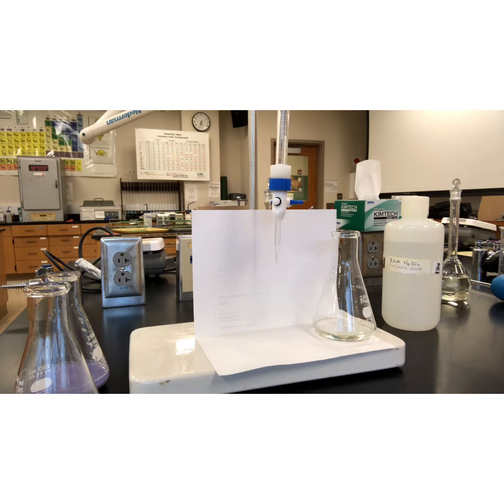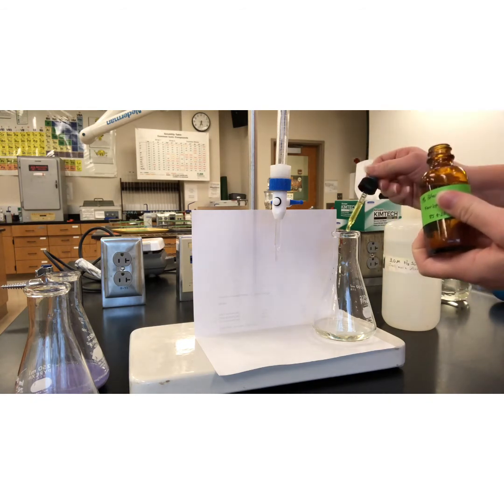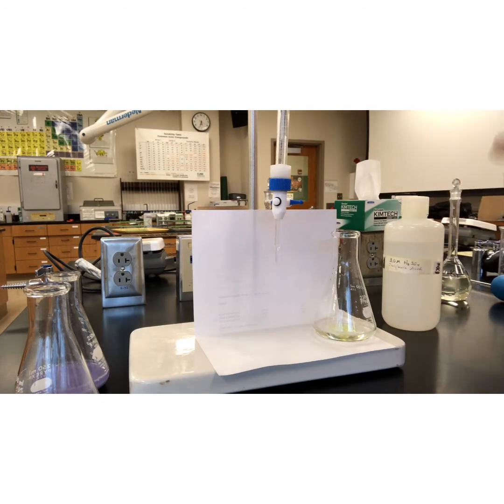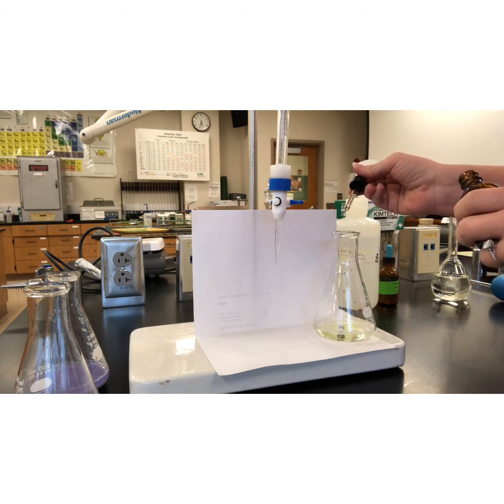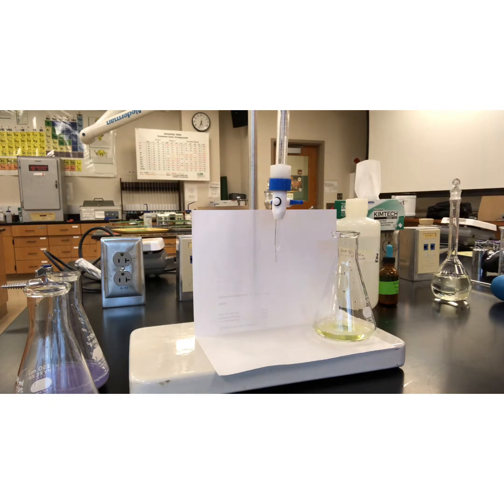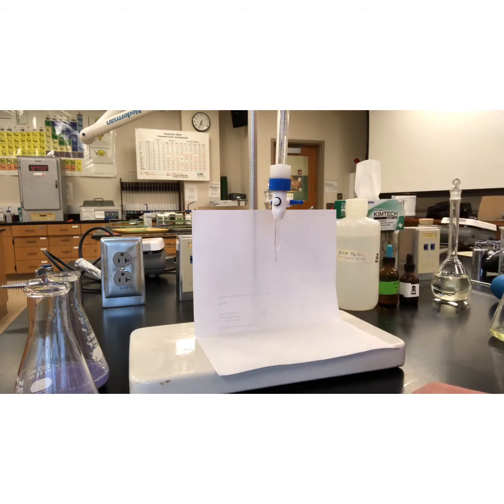All right, 5 milliliters, 3 drops of my ferricyanide. 1, 2, 3. Here we are, indicator. 1, 2, 3, 4. Swirl it. Gotta make sure I refill my zinc sulfate so I don't run out of my titrant.